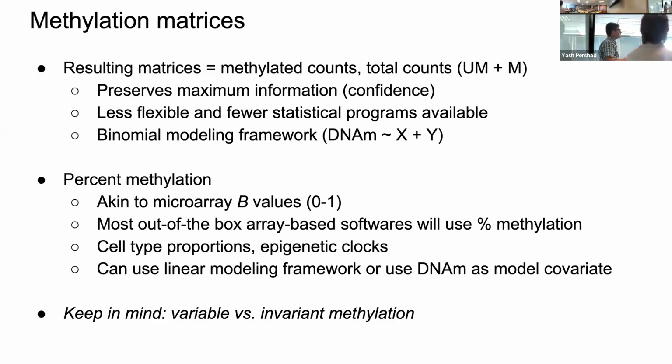Yeah, it'll be in the next section, but essentially all of it has been built off of the arrays. So Hannah, who's right here, is working on making one for the enzymatic methylation, but the array ones work okay on sequencing data because the CpGs are somewhat correlated. So we've been using the ones that currently exist, but nothing exists yet to date on the enzymatic methylation. Comparing the estimations from some of the common software, it does a decent job, which I'll show later. So that's reasonable.